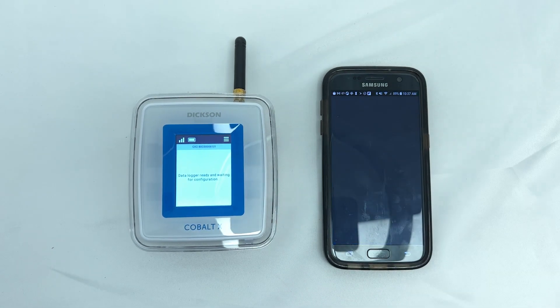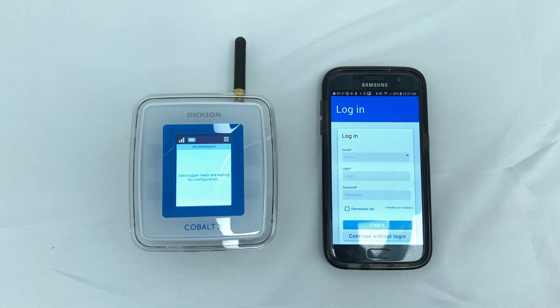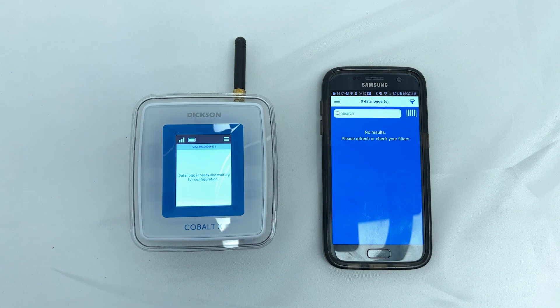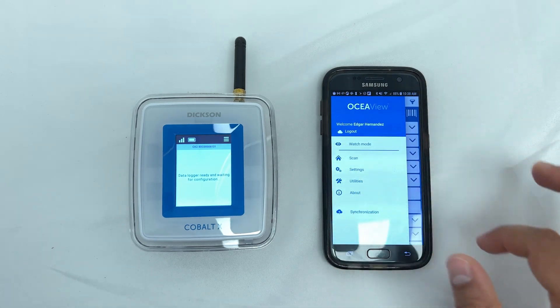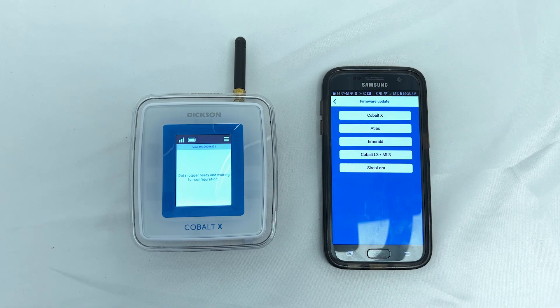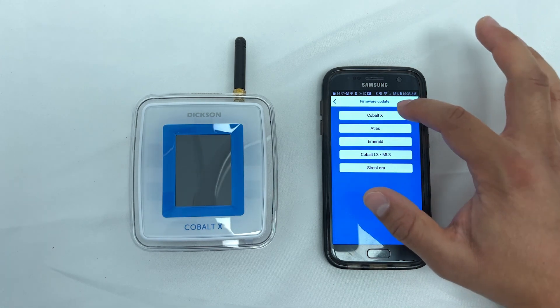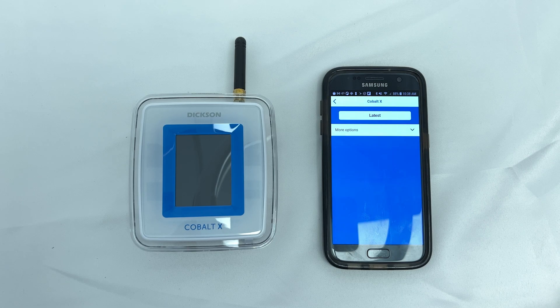Begin by opening the OSIA View mobile application. Press on the three lines at the top left of the screen to access the menu, then press on Utilities, Firmware Update, Cobalt X, and select Latest.